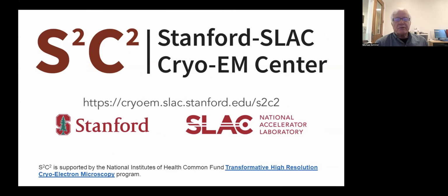One of our popular training and support activities is a weekly session on interpreting cryoSPARC Live results for our users, telling them how to interpret their data and how to process it efficiently and pick particles that really are particles. It's a fun session to attend, so please join us for training or screening or specimen data collection. Thank you.